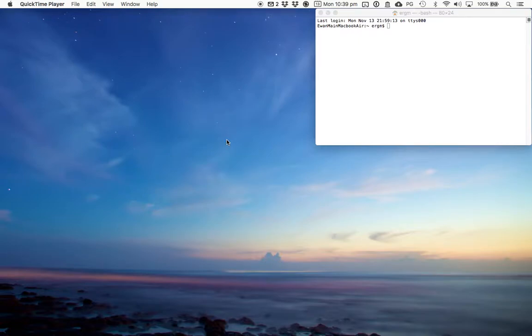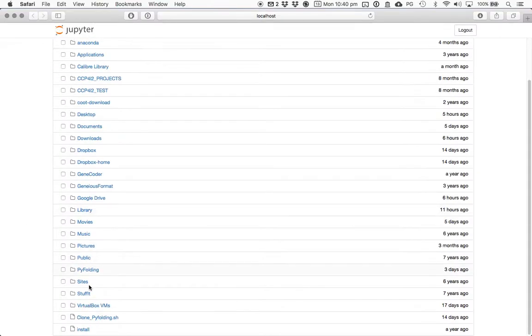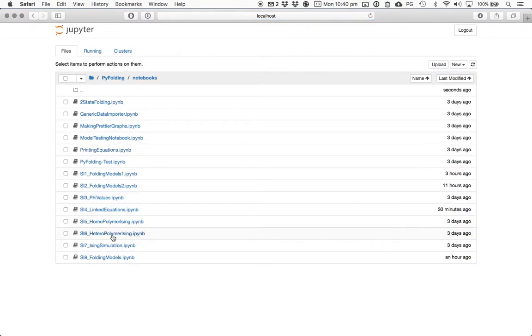In this video, I'm going to discuss how we can fit data to an Ising model using Pyfolding. So as per all my other videos, let's start by opening Jupyter Notebooks. And if we navigate to our Pyfolding folder and go to our notebooks, you can see we have these three notebooks here which describe in detail how to do so. But let's look for this video on how to do it for the heteropolymer Ising model.